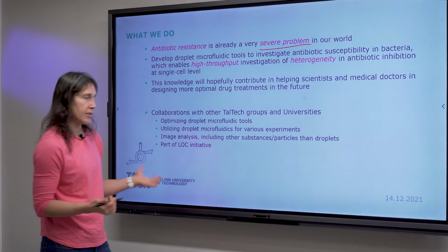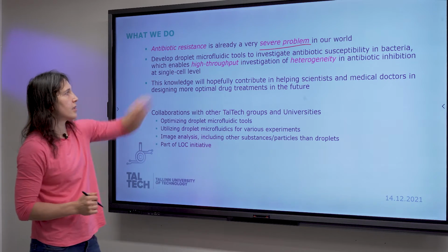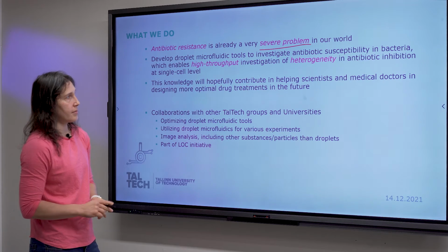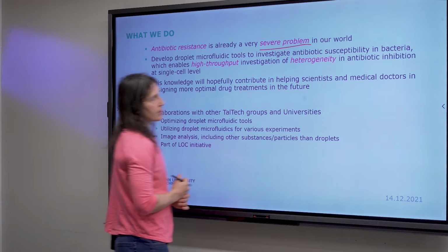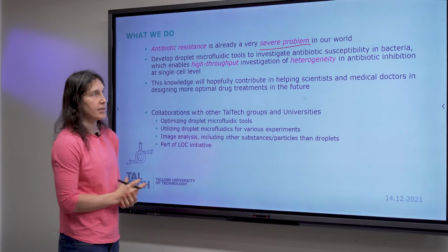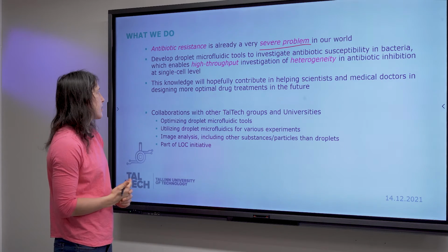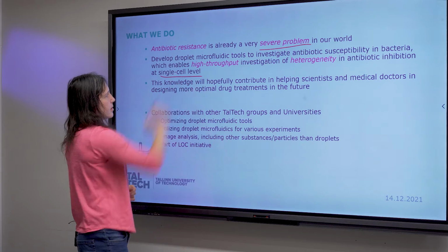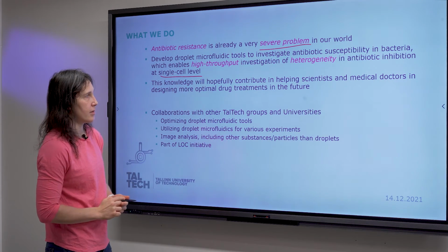Because we use microfluidics, this enables us high throughput investigation, and it enables us to investigate heterogeneity in antibiotic inhibition also at single cell level.